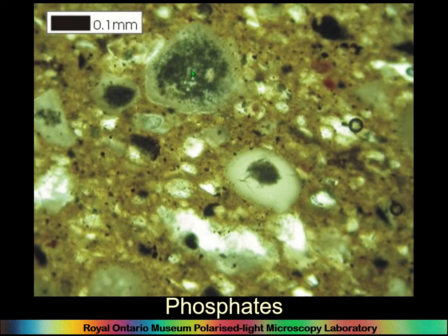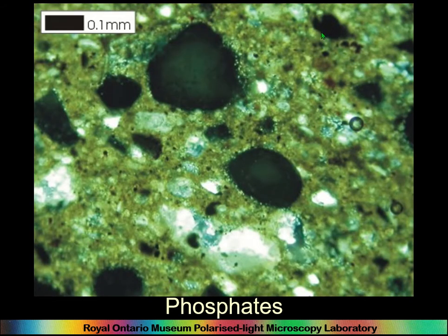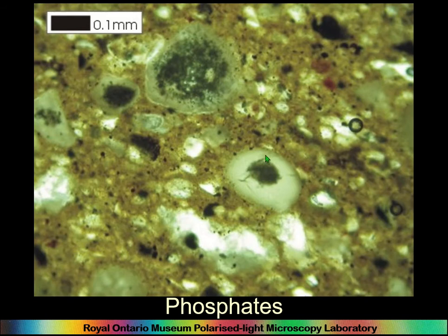And so this is where it enables you to possibly find something very diagnostic to help you find out what these things are. You might at first think that they're just holes, or you might think they're isotropic because they are almost isotropic. But you can see there's just a little bit of birefringence there. And so you know that this is very low birefringence and typical phosphate. And in plain polarized light, you can see, oh yeah, this looks like a bone, this looks like a phosphatic ooze. Yeah, that's what's going on here.